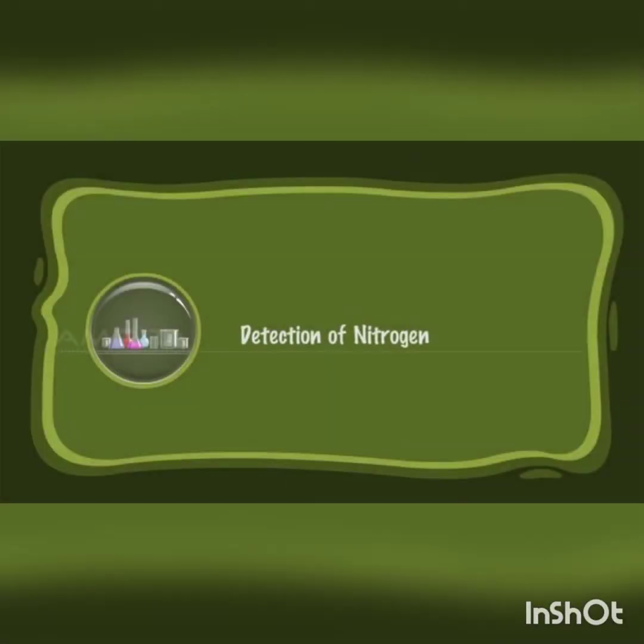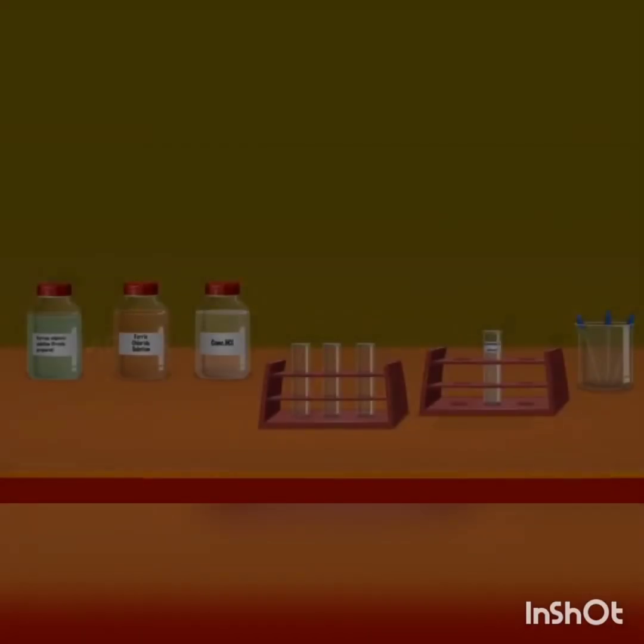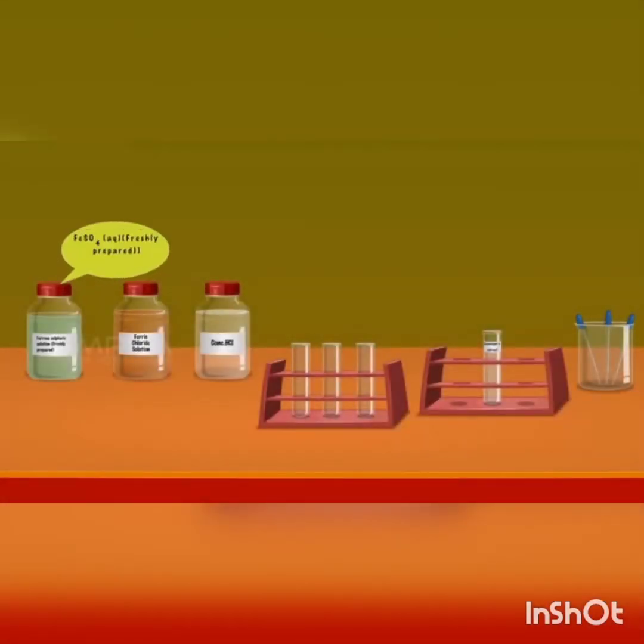Detection of nitrogen. We require freshly prepared ferrous sulfate solution, ferric chloride solution, concentrated hydrochloric acid, test tube, Lassaigne's extract, and droppers.